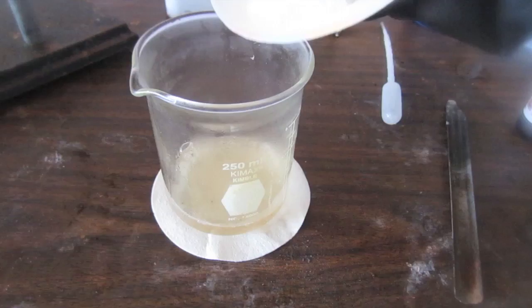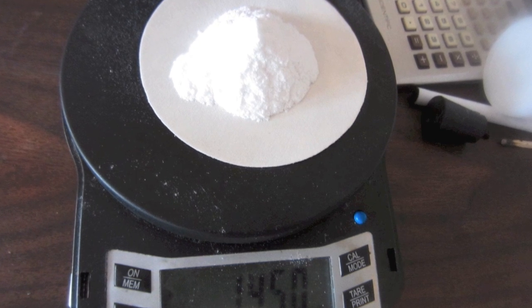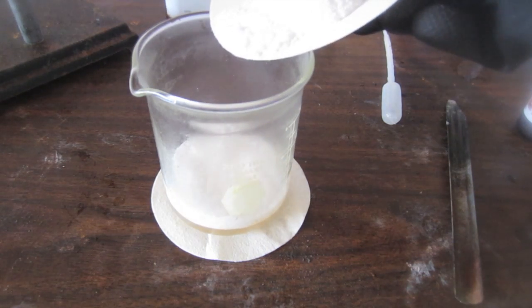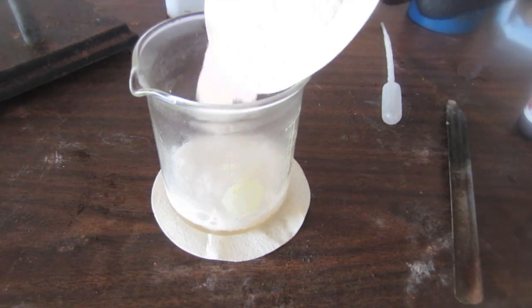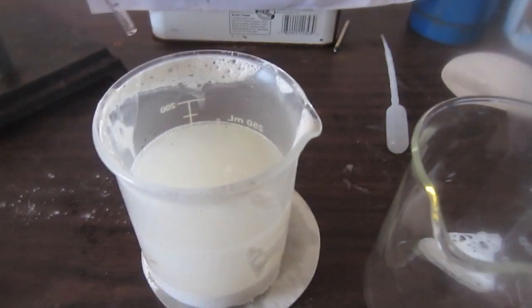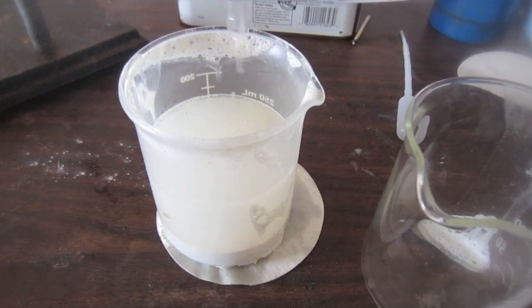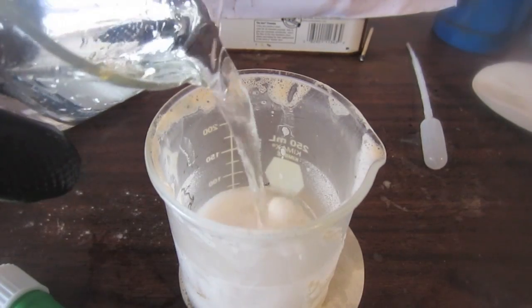After all the manganese has reacted, the solution will become a nice pleasant pink color. At this point you want to get the manganese out of solution into something insoluble, so you need to react it with 14.5 grams of sodium hydrogen carbonate, which will make the insoluble manganese carbonate. Let the precipitate settle and decant off the liquid on top and wash it several times with water.